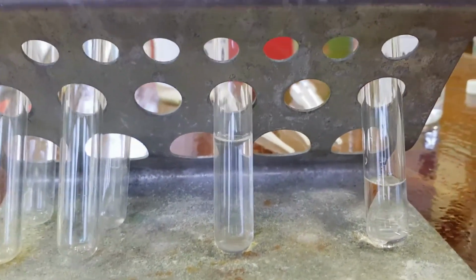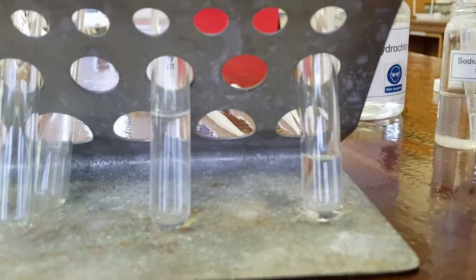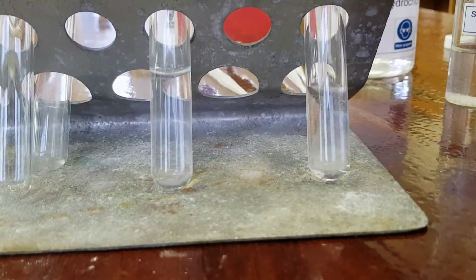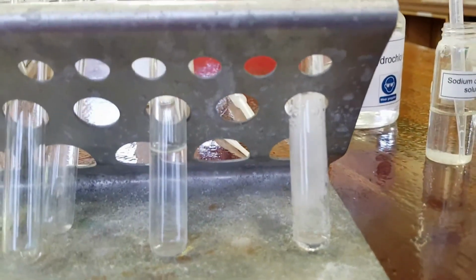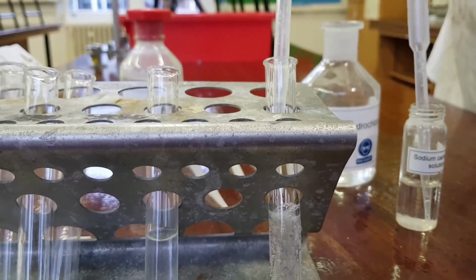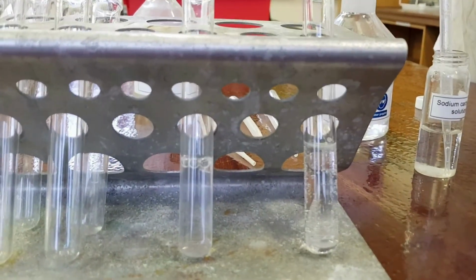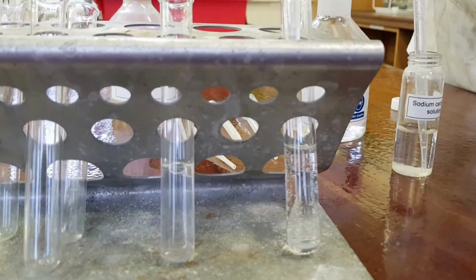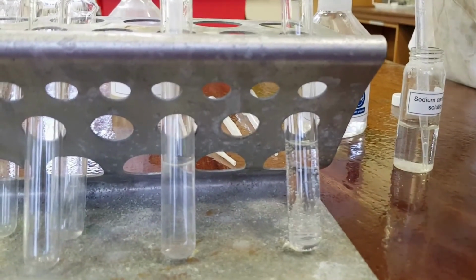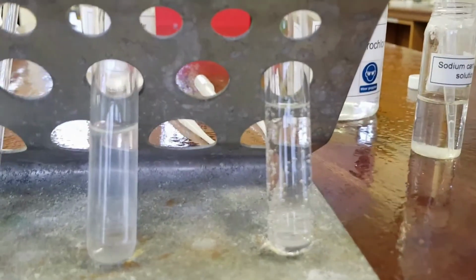Now we're going to add some acid. And as you should remember from year 8, acid and carbonate, there you go, lots of fizzing, gas being given off. That gas is carbon dioxide. So Mr. Reeves is sucking up the gas from the test tube on the right with a pipette, and he is bubbling it through the test tube on the left.